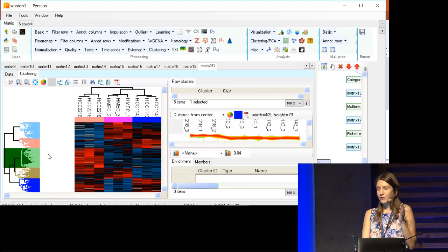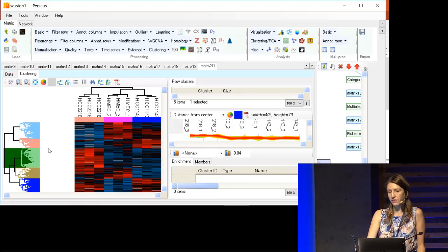At least for 30 or 40, I tried it earlier and it worked. So the limit is between 40 and 100. Okay, but I think that is maybe something that the developers can look into, because that would be the way to really zoom in and then get out that figure.